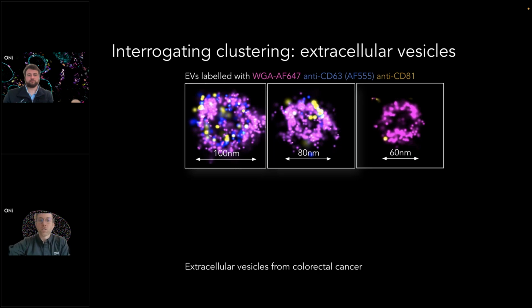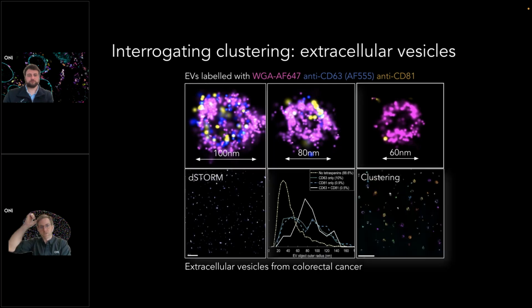And so with just some statistical analysis downstream, in, again, your favorite tool like Prism or Excel or Origin, you can do some simple plotting. Here, what's really interesting in the graph in the middle is it shows that for the single positive EVs, those are ones with the blue lines, so it's either CD63 or CD81 positive, we have a pretty broad distribution of sizes, but relatively small.